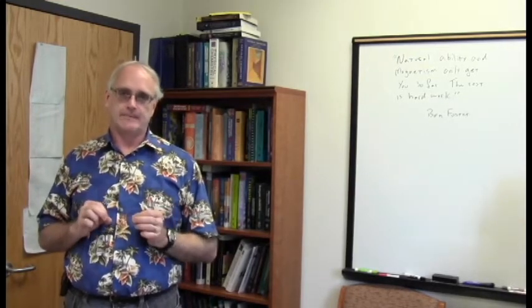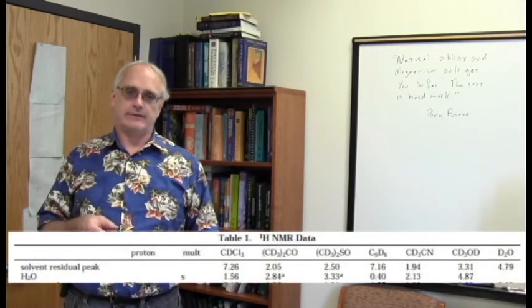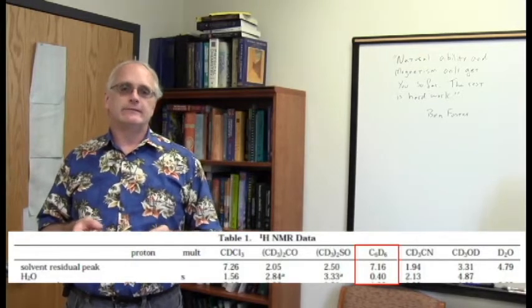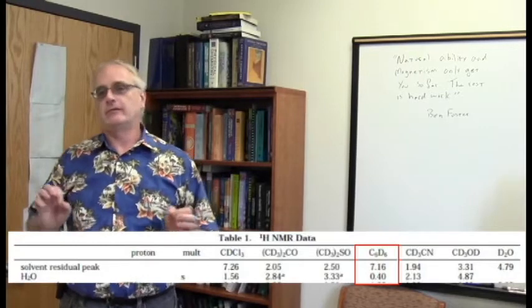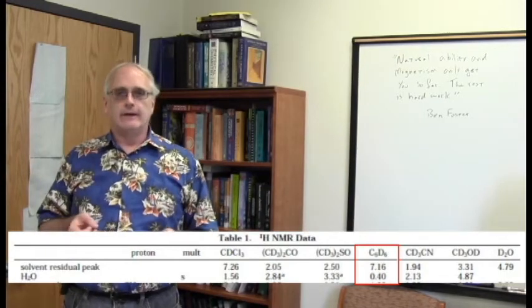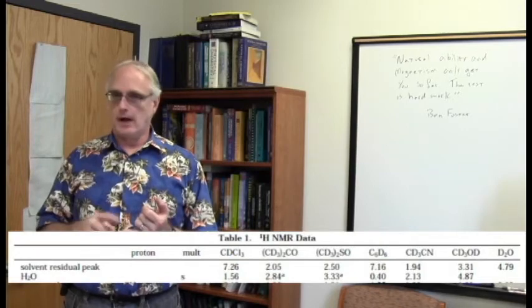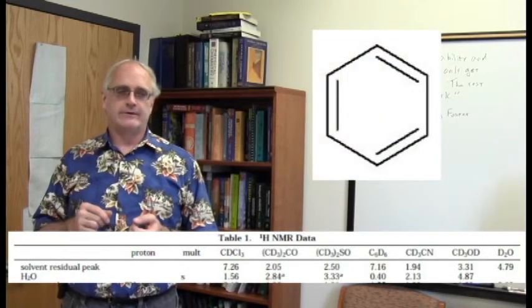So I pull out specifically three cases here. One, they show the chemical shift of water in benzene, in deuterated benzene. Now, you'll notice that it's given as around 0.4 ppm. My gosh, that is so upfield, it's approaching TMS territory now. But think about it. This is water sitting in benzene. Benzene itself is nonpolar. It is not a hydrogen bonder. I interpret it this way.